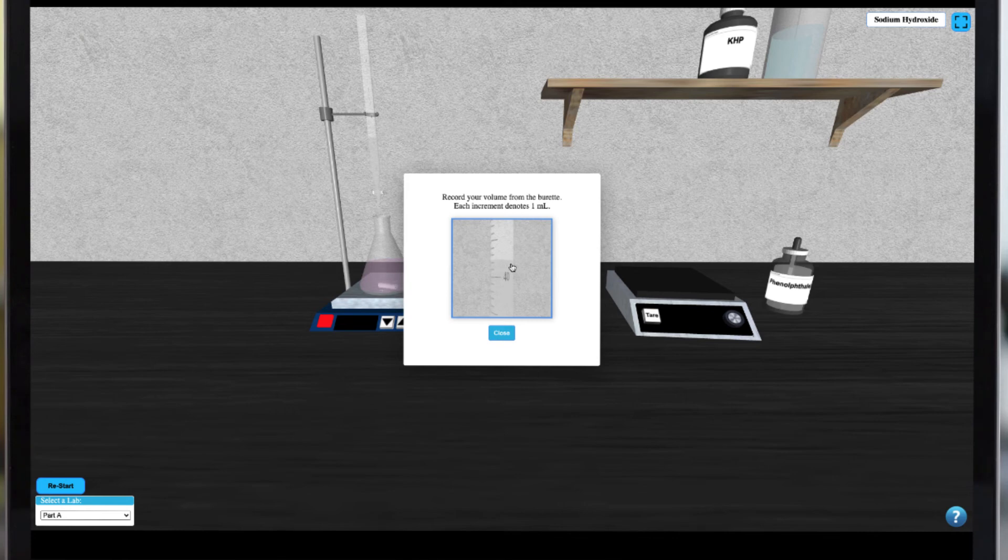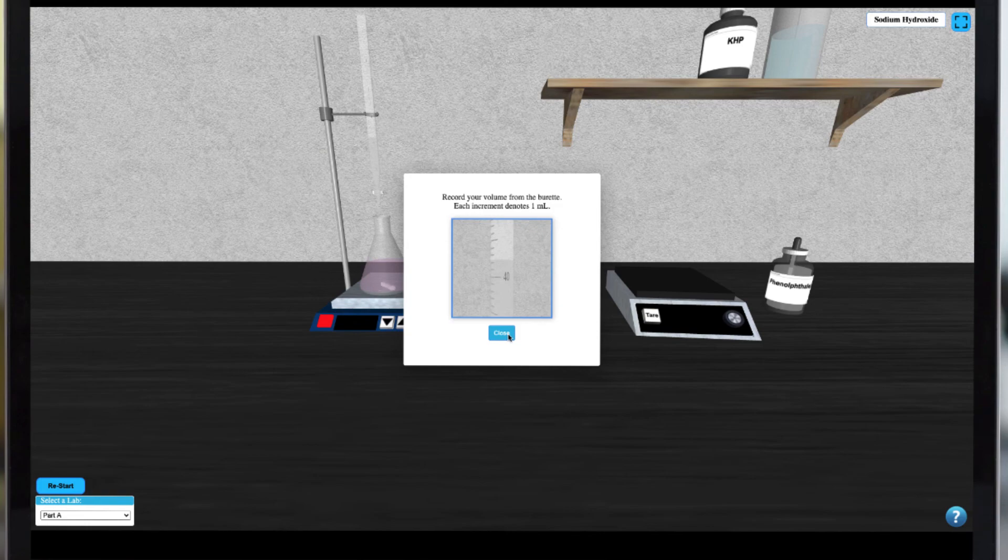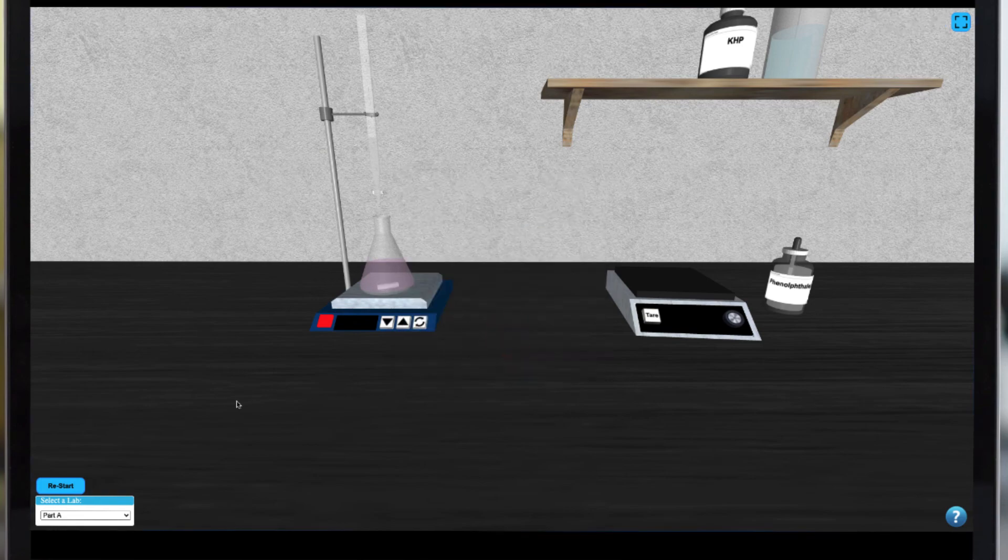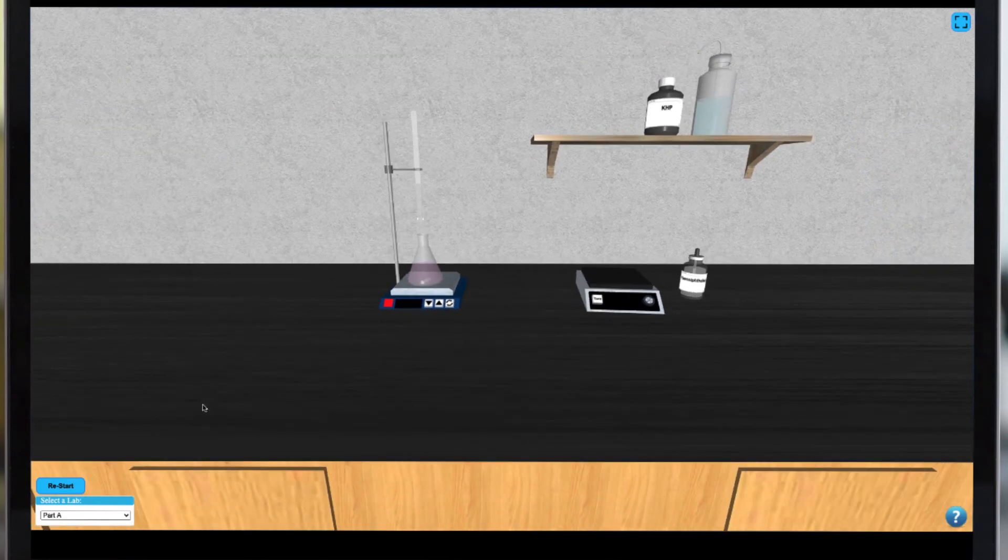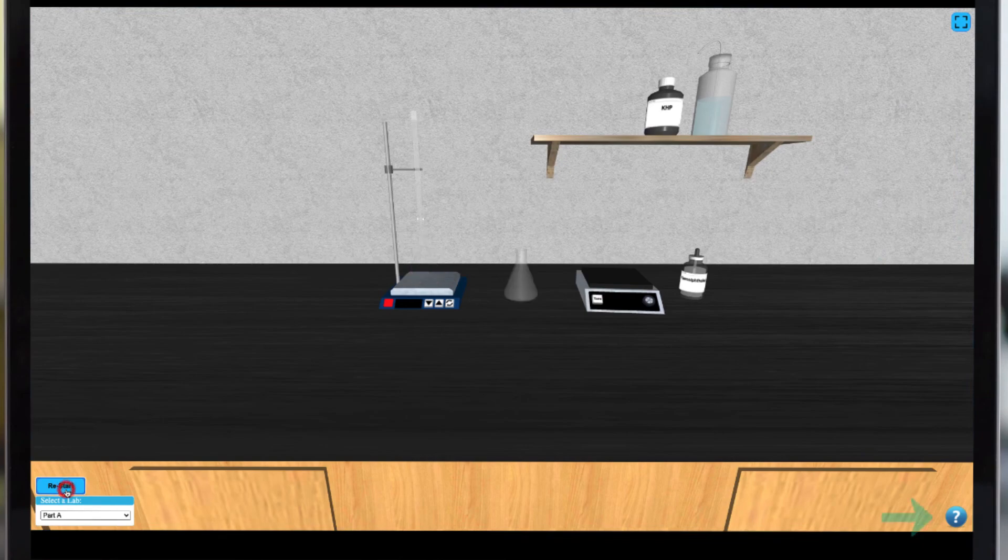Subsequent parts of this experiment involve variations of this procedure, so be sure to follow any additional instructions by consulting the help menu at the bottom right of your screen.